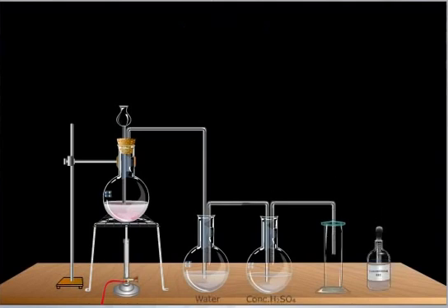Add a few drops of concentrated hydrochloric acid to the potassium permanganate solution through the thistle funnel.